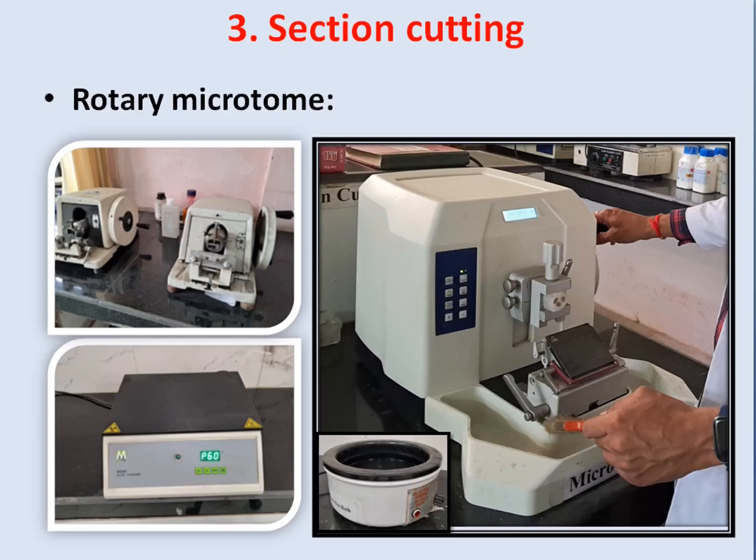After putting this tissue on the heating plate, you put this section on the glass slide, and these glass slides are incubated at 62 degrees centigrade in the incubator for further fixing. Up to this step we have not stained the tissue. So our tissue section is there, but it is not stained and it is not visible.